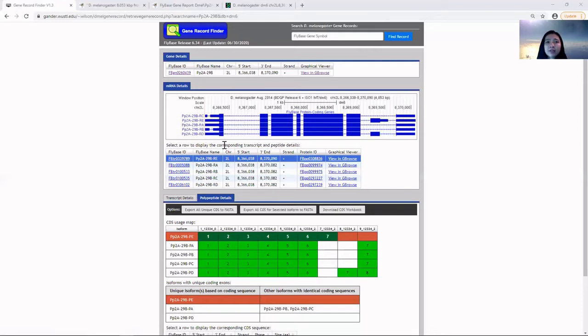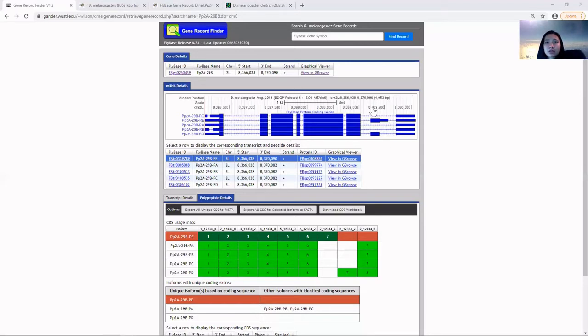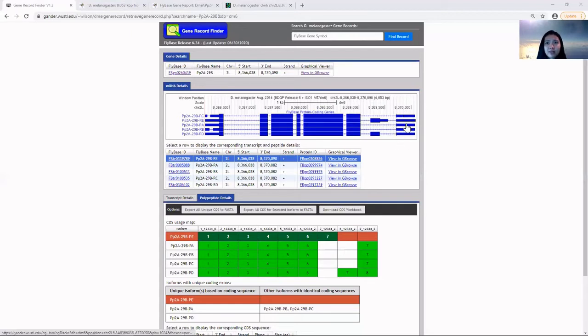Based on this track, the isoforms differ in the five prime untranslated region and the terminal coding region, along with the three prime untranslated regions.